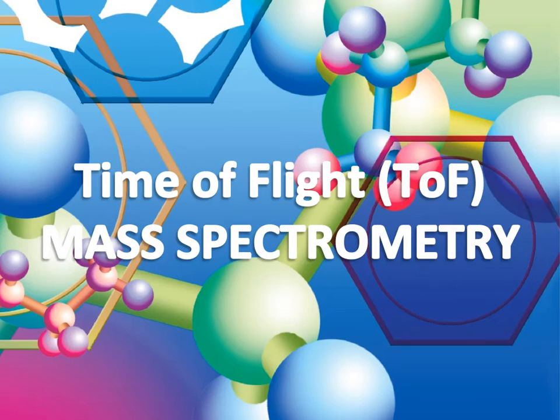So now we're looking at mass spectrometry and time of flight mass spectrometry in particular. Time of flight is a version of mass spectrometry that AQA focuses on, and you've just got to be aware of this, because if you do a search online for mass spectrometry, you're quite likely to find other versions of mass spectrometry, ones that employ a slightly different technique, although they're fundamentally measuring exactly the same thing. You will find different descriptions of how the mass spectrometer works, and you've got to be very wary of that. So you must make sure that you're definitely always looking at a resource that is focusing specifically on time of flight mass spectrometry.